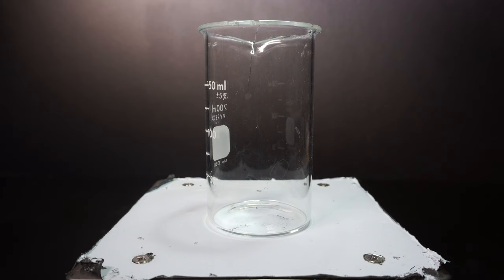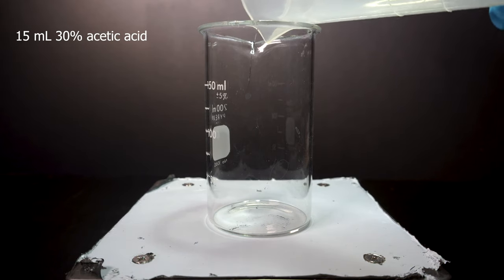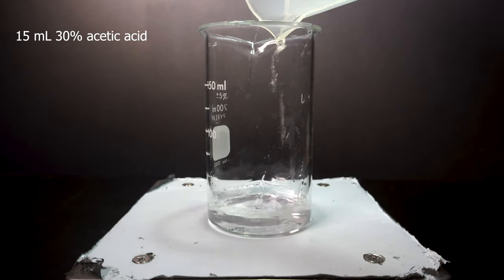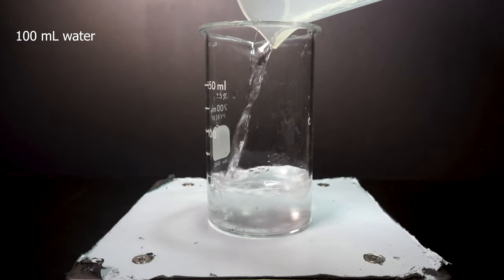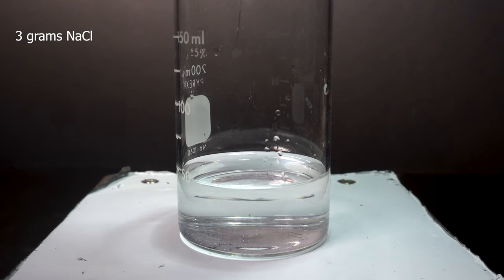First we need to clean our pennies of oils and copper oxides that are present because pennies are usually really dirty and the dirt or oil could cause complications later on. To do this we add 15 milliliters of 30% vinegar to a beaker followed by adding just around 100 milliliters of distilled water. I forgot to film it but you also add in 3 grams of kitchen salt.